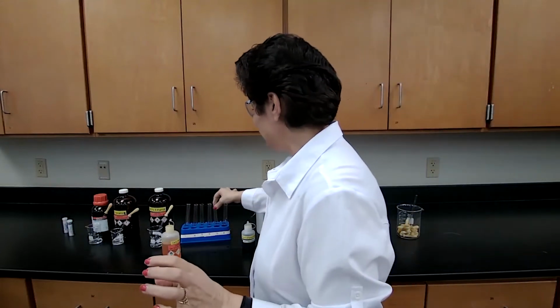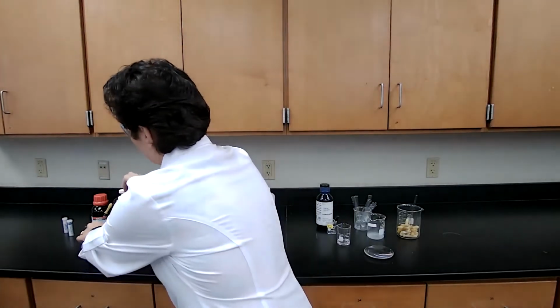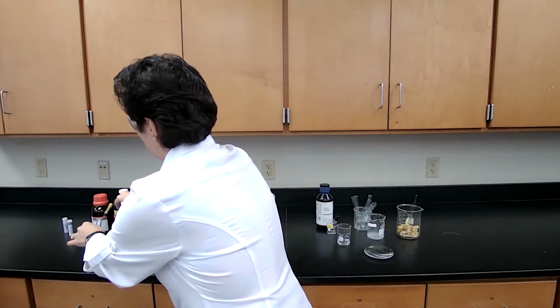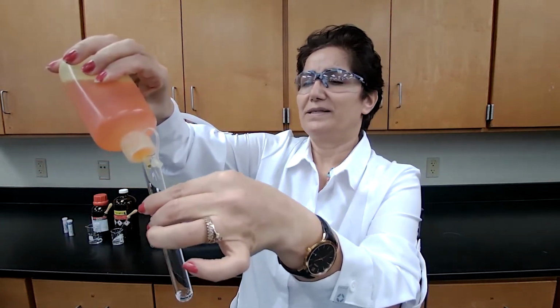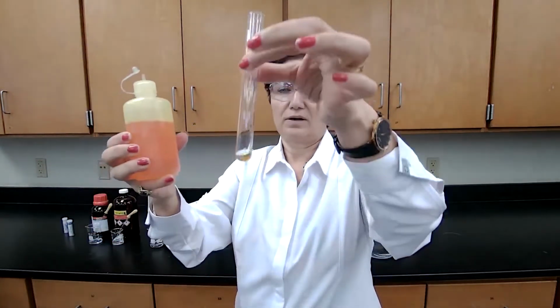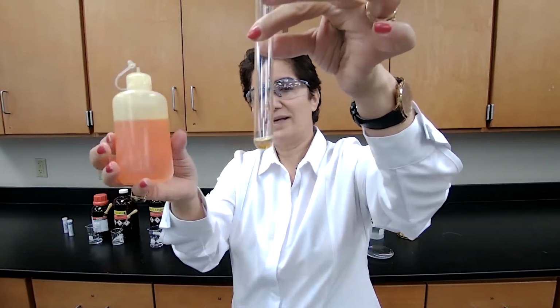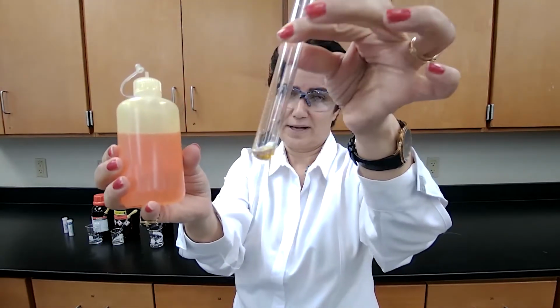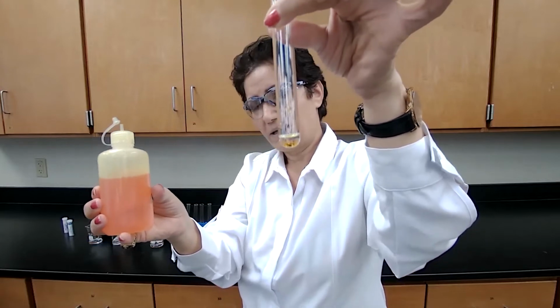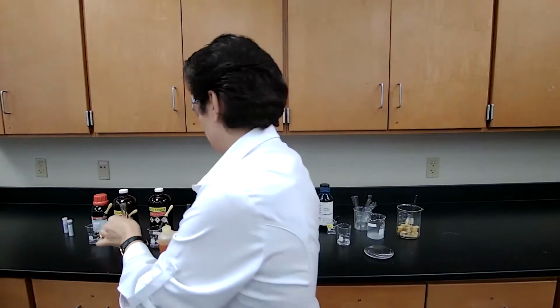Now, if I repeat the same functional group test for hexane, I'm going to add 3 drops of hexane in a test tube and add the ceric nitrate reagent. With the ceric nitrate reagent, see the color, it's not giving me that red color that I got for the alcohol. It's a lighter yellow color just because the orange color is diluted. So I have a negative ceric nitrate test for hexane.